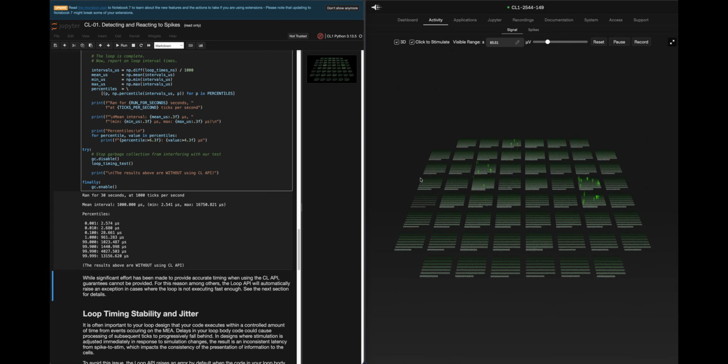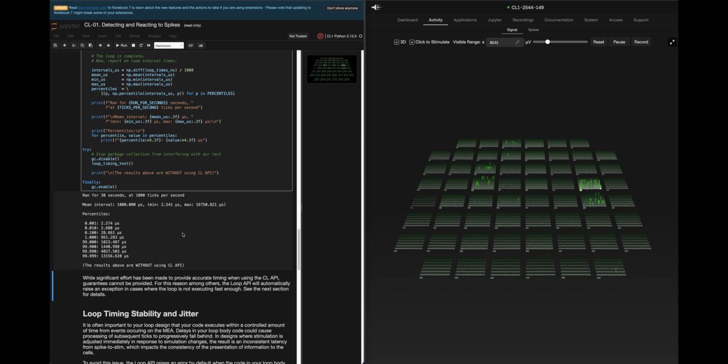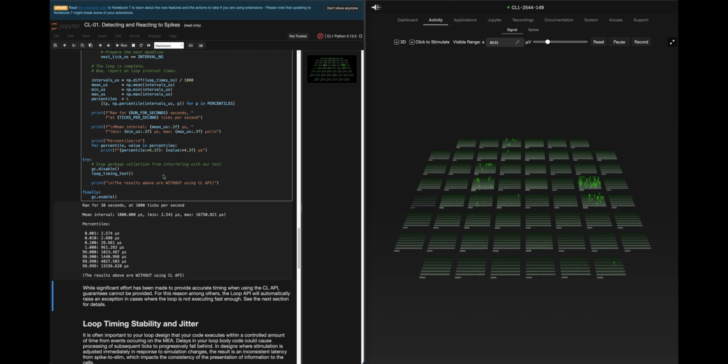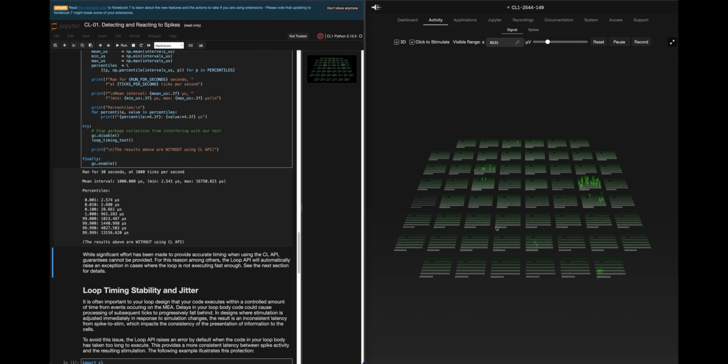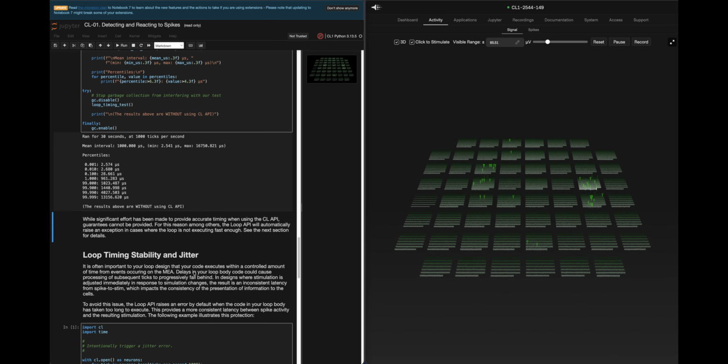Okay, I just went and disabled that program because I want to keep the tutorial from confusing people, but those stimulations were coming from another program. It was not from this. This doesn't stimulate right here, so that's really important to note. It came up because I have some timed recordings that happen over here, which is not what we're into quite yet, but it's good to know.